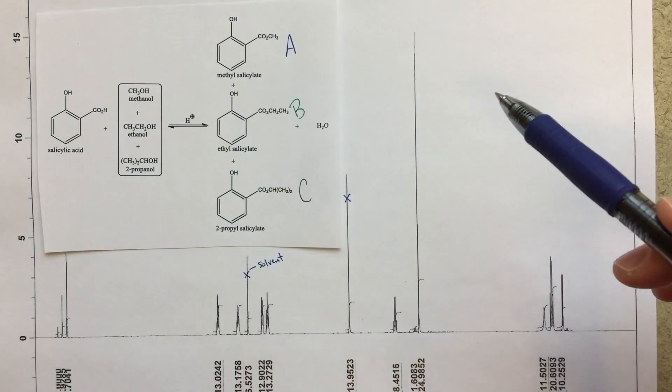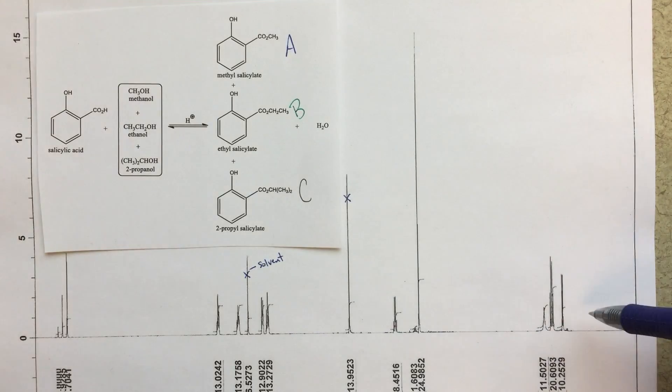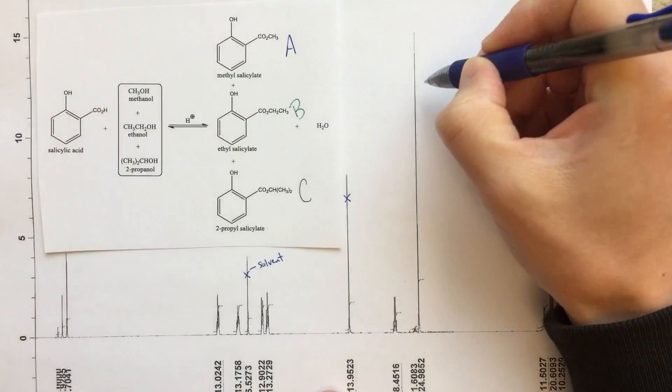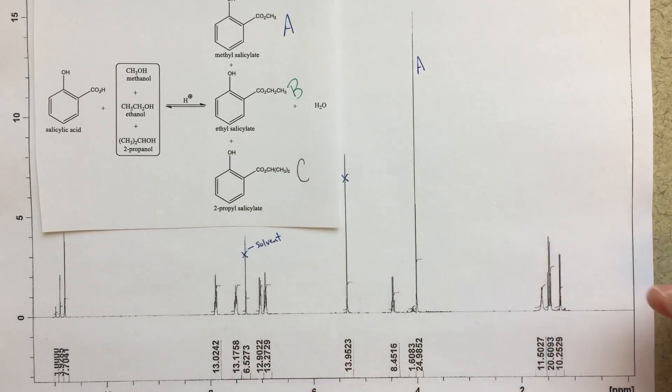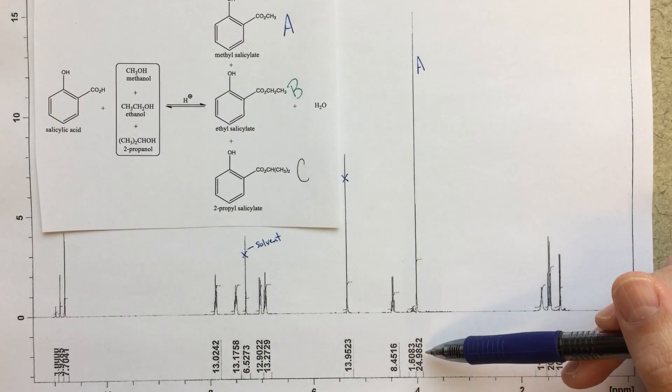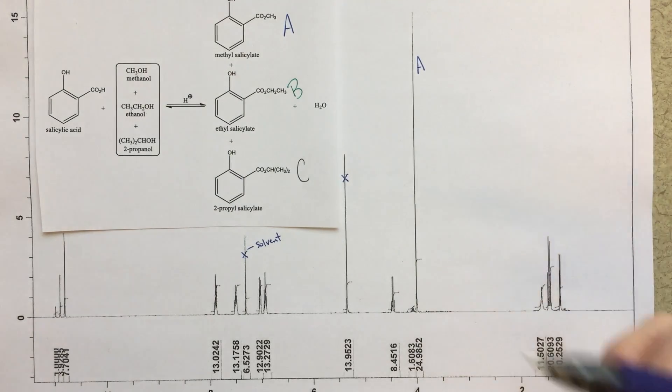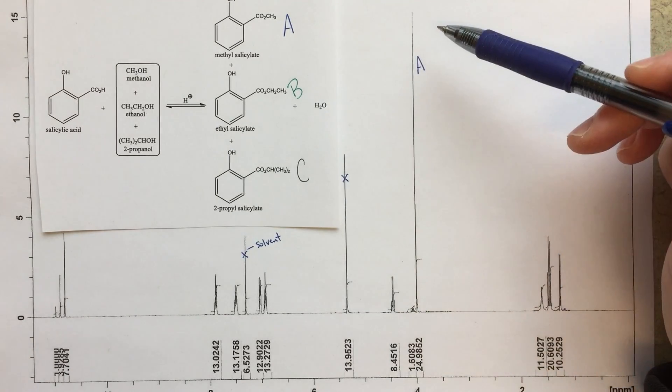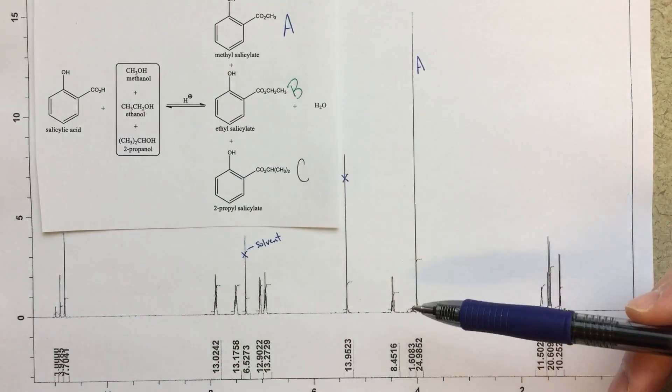So this methyl group, it should be pretty high, and it should be a singlet. So out of my peaks in this region over here, the one that fits the bill very nicely is this peak here at about four. That's, I think, very clearly going to be from this methyl group. So this integration of 24.9852, that's a pretty big integration.